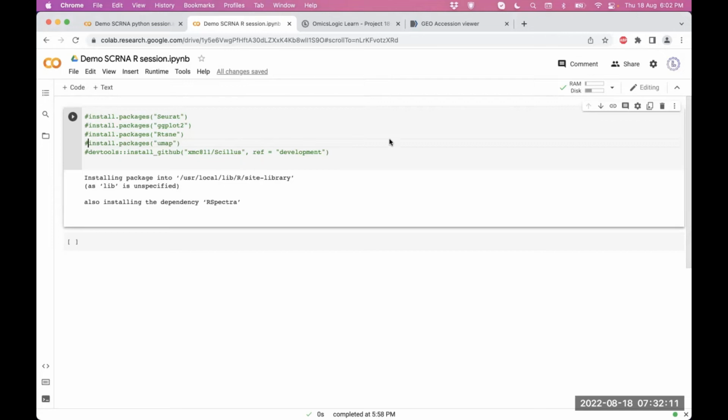So we will again do some of the coding, and it is going to take a while for the coding to load and some of the packages to install. So it is okay if you are not able to follow along, and you can get the recording and then do some more work with some more coding, referring to the recording.